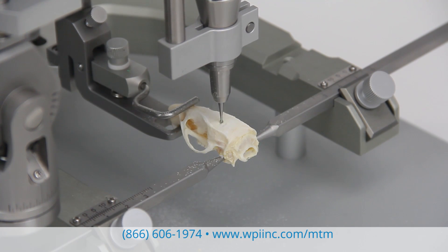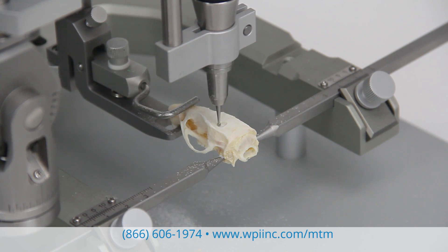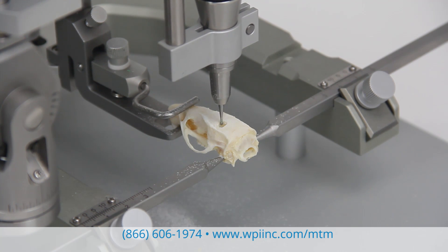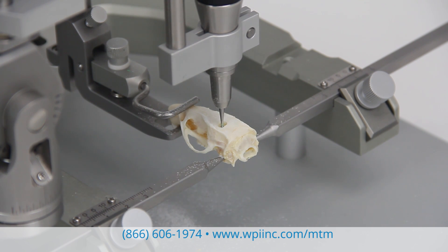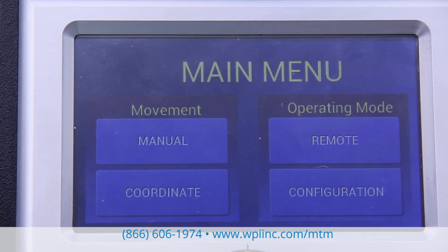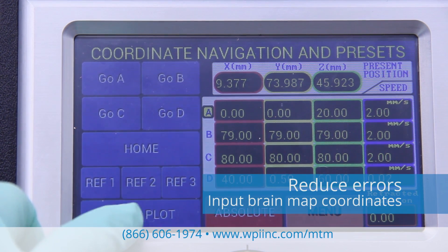This motorized frame will simplify your surgical needs and reduce human error. The motorized axes of the MTM3 provide precise, controlled, three-dimensional placement of any probe or accessory within the working space of a stereotaxic frame. No computer is required. It comes with either single or dual manipulator arms, and you can directly input specific brain map coordinates, eliminating coordinate calculations.